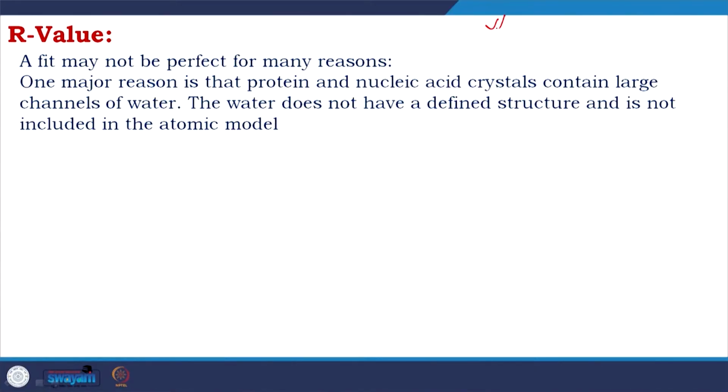If it is an enzyme, it is difficult, because if you add A plus B to get C plus D, in the mixture there will be A, B, C and D. I explain a little bit. So, remember I told in crystallography, crystallization is a very critical part, we all discussed about that. Now, to get crystal, the crystallization process, one of the major challenges, it should be homogeneous.